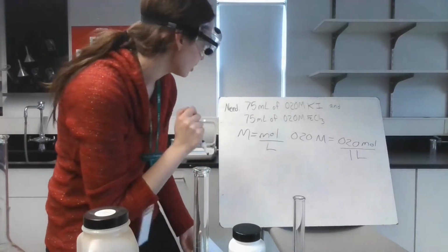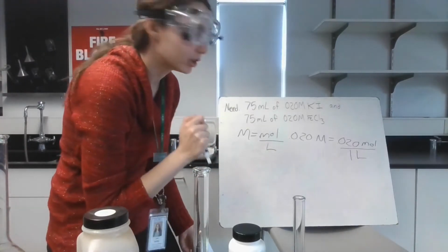I don't need 1 liter of this though, I need 75 milliliters.